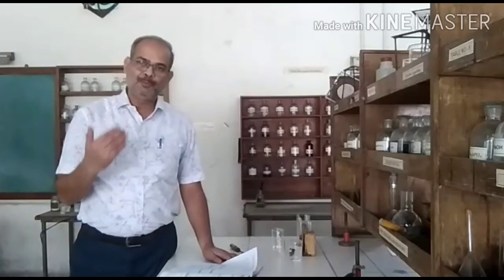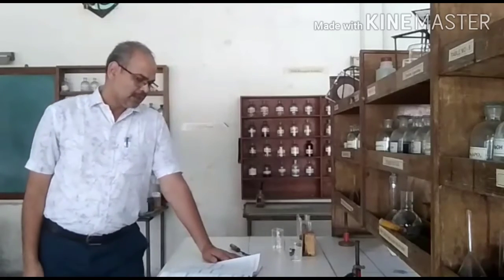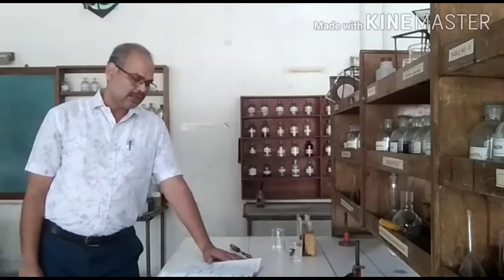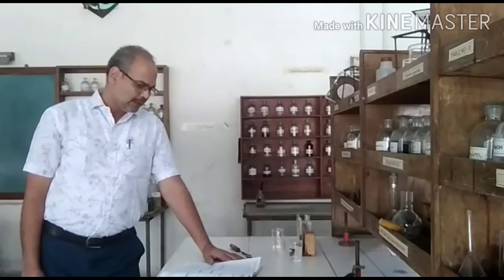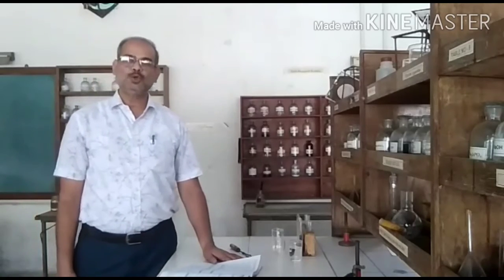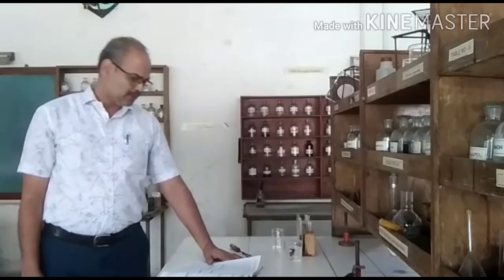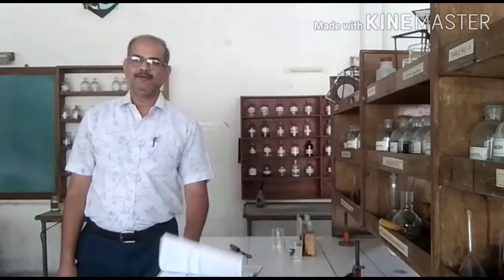So now you have to report the result of your practical. Just come below it. The given inorganic mixture number 1 contains the following two anions, that is acidic radicals. Number 1, you will write CO3-2. In the bracket, you will write carbonate. Number 2, SO4-2. In the bracket, you will write sulfate.